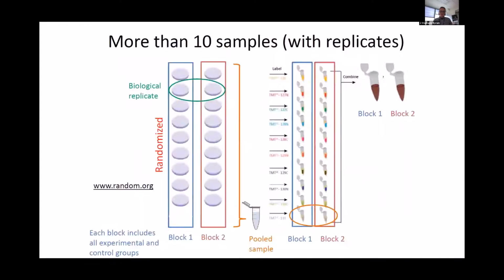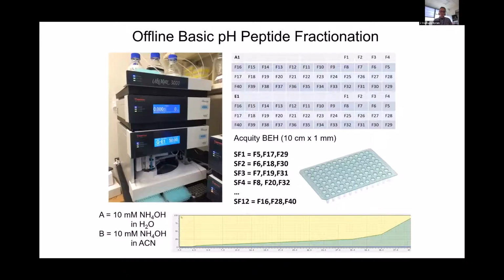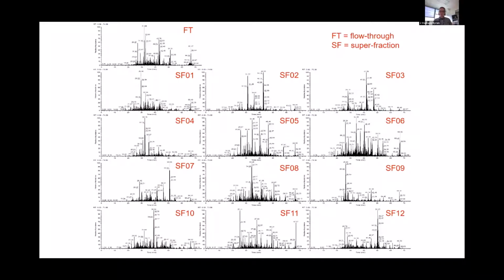Okay, so that's a data-dependent acquisition type run, where it really depends on the peptides that are coming off that column. The most abundant peptides are going to be selected for fragmentation, and that's going to be the values that we get. That's where you can get a missing value for proteomics data. Doesn't mean it doesn't exist. It just means it was not detected in the mass spectrometer.